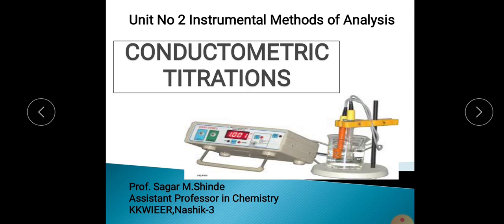To overcome these drawbacks, modern methods were required. New methods were implemented, and these new methods are with some instruments. These methods are called instrumental methods for the analysis.